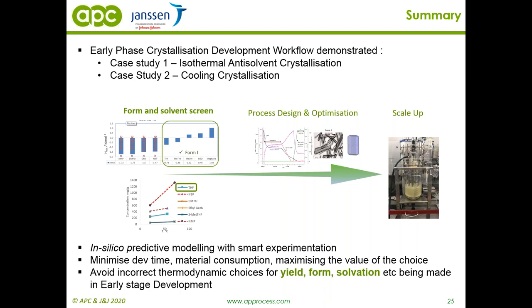Another question from Marco, but this time Marco from BI, Sant'Agostino. He's asking which precision in the computed solubility data you usually get. Can you comment on charged molecules like salts? So salts are more difficult to predict the solubility for. We were modeling some cases, and it worked reasonably well, but there were also some cases where it just didn't work much. So I can just comment that salts are a bit more difficult, and sometimes it can work.